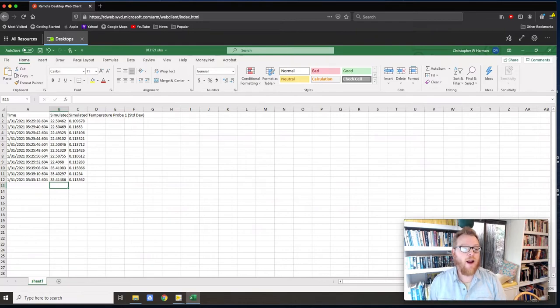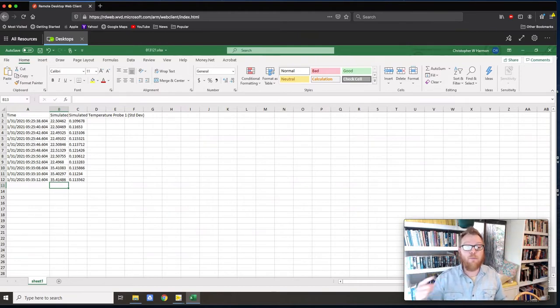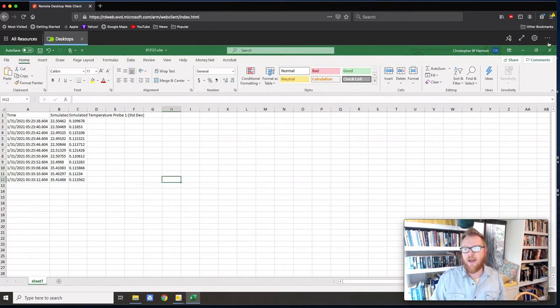And if I was doing an experiment where I was constantly heating something up and letting it get to a steady value, and then heating it up again, and then heating it up again, I could keep recording in this fashion. And not only would I be writing this down in my lab notebook, maybe estimating from my block diagram, but then I could get a much more precise value than my eyeball estimate recorded in this computer.